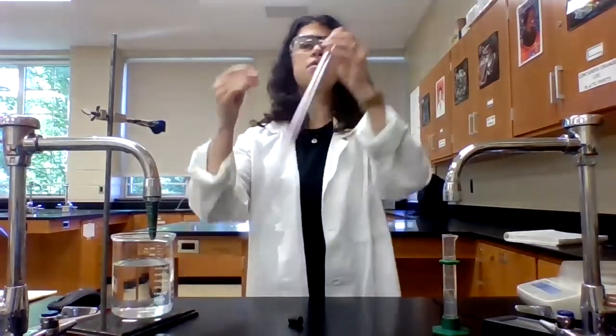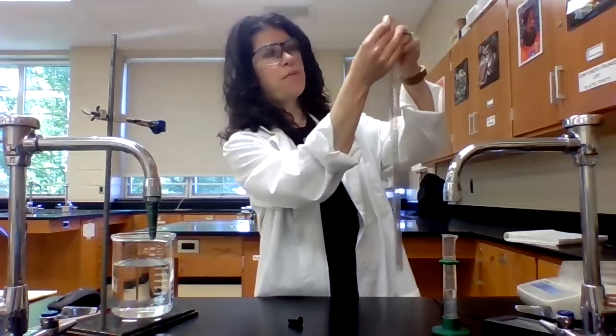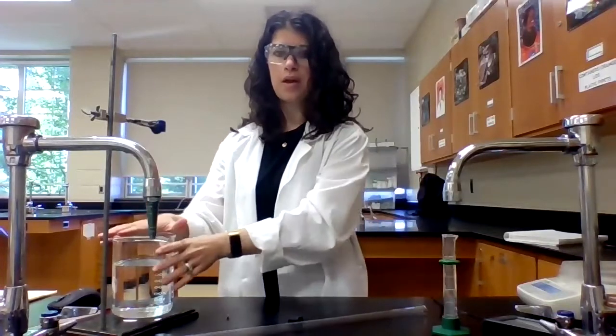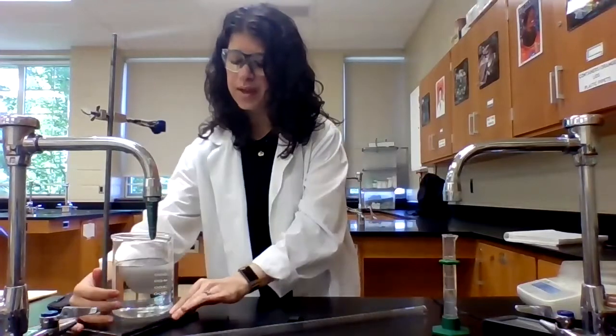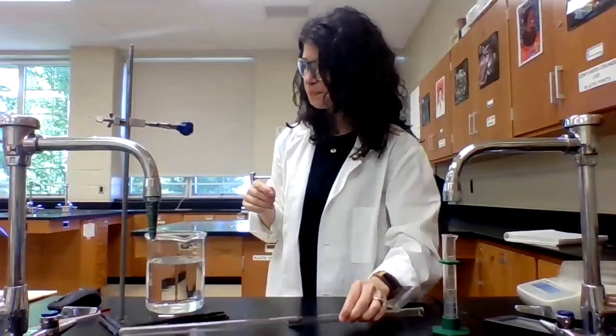The reason I'm doing that is because this is going to secure the magnesium ribbon at the top of the eudiometer. I'm going to do this reaction in the eudiometer over this beaker filled with water. The clamp here is going to secure the eudiometer.